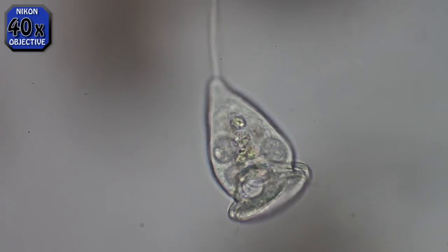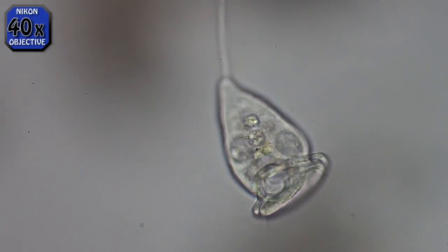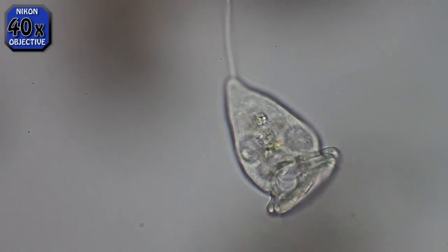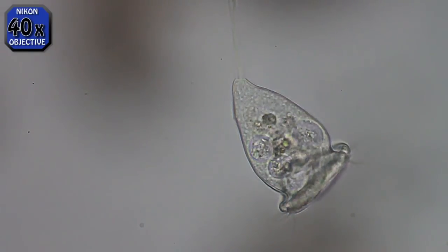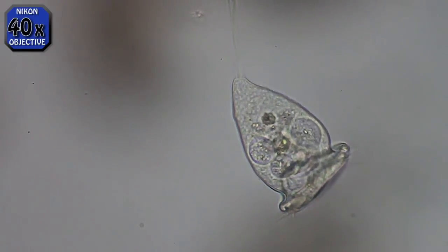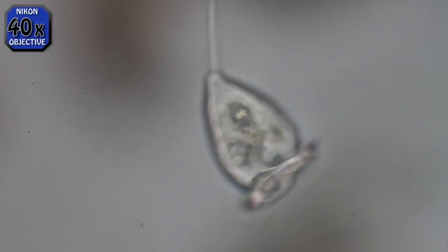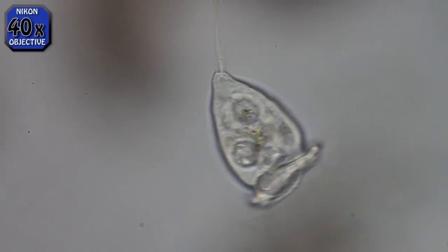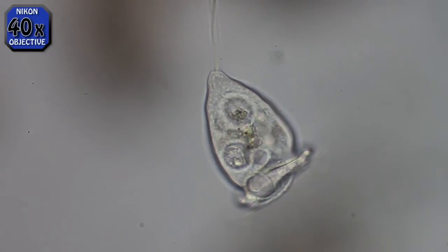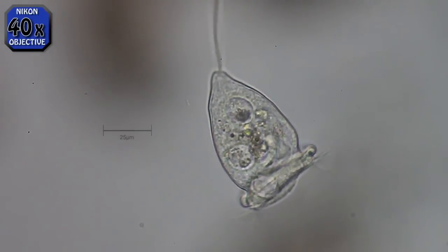The cilia around the ring at the bottom keep the current going and suck in the small particles, which go into these food vacuoles. When it gets about the right size and is full of the right amount — now watch — see it breaks off and moves up to the other end of the Vorticella. And now a new food vacuole is starting where that one was.